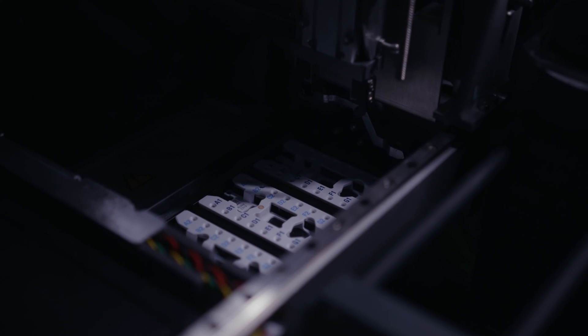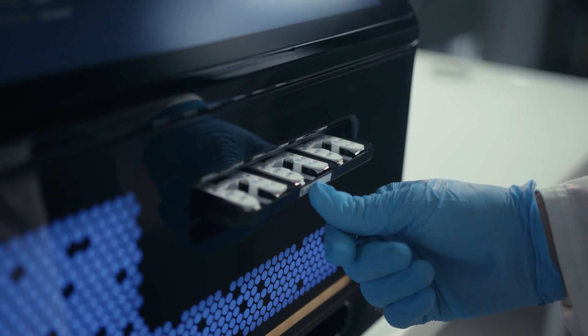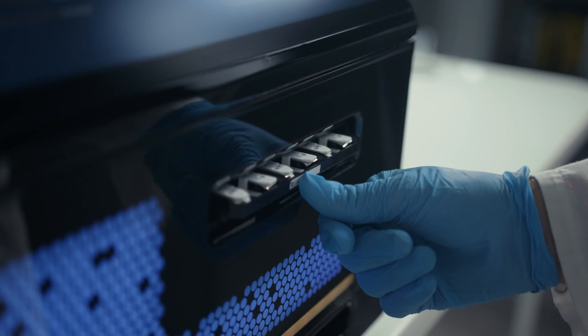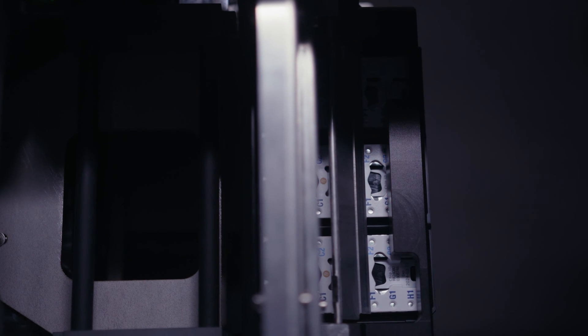And next to flexibility, it comes with throughput too. If you insert your last plate as you pack up and let NIYO Plus finalize it overnight, you could process up to 768 samples per eight hours of lab work.